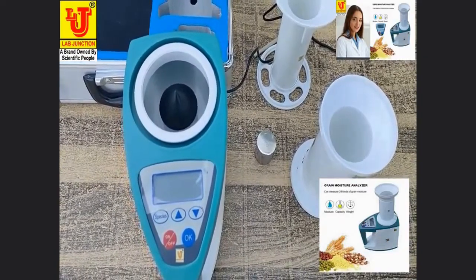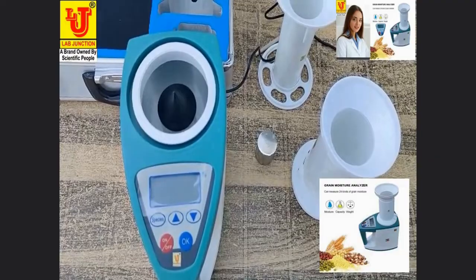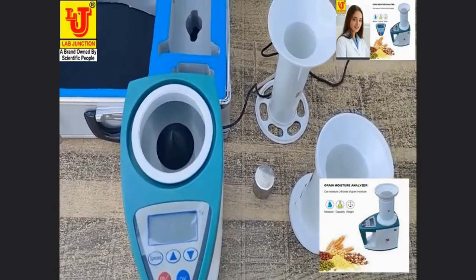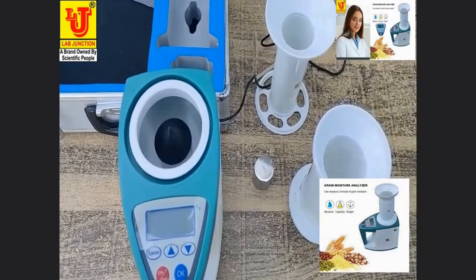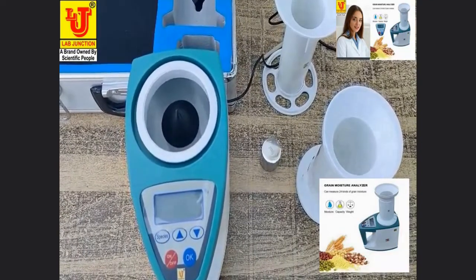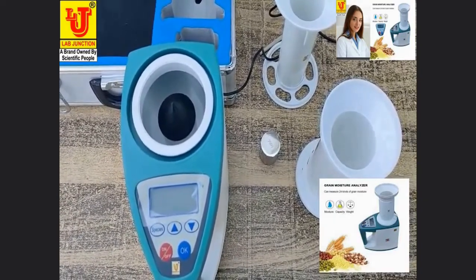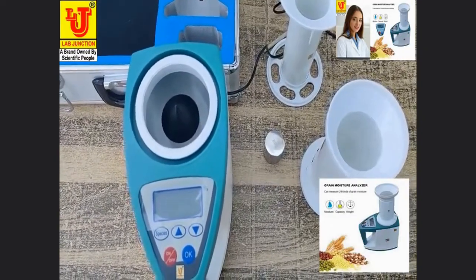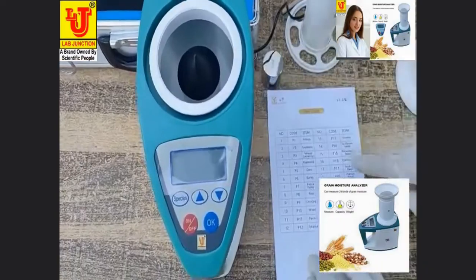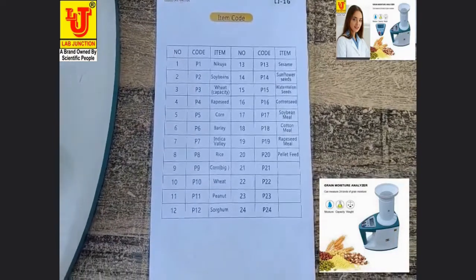With this instrument you can detect grains like: nikua, soya beans, wheat, rapeseed, corn, barley, indica valley, rice, peanut, sorghum, sesame, sunflower seeds, watermelon seeds, cotton seeds, soya bean meal, cotton meal, rapeseed meal, and pellet feed. These are all the items you can measure with this grain moisture meter.